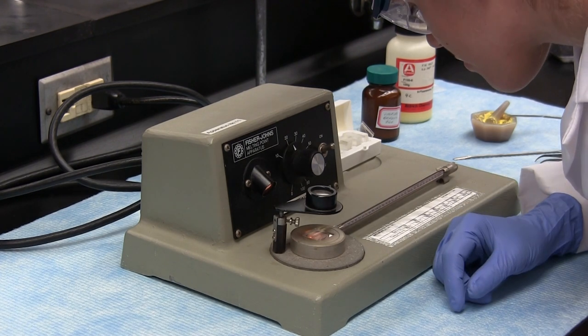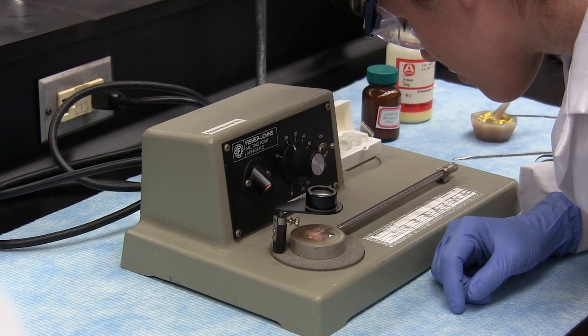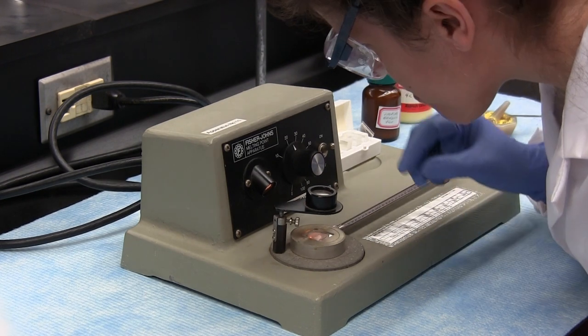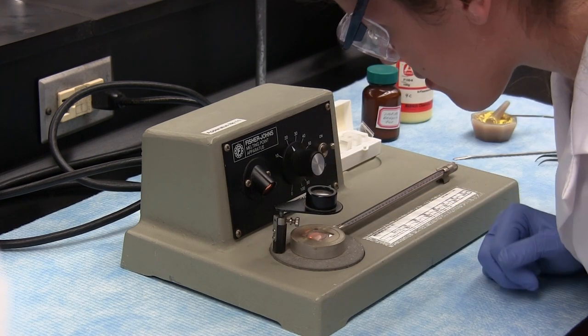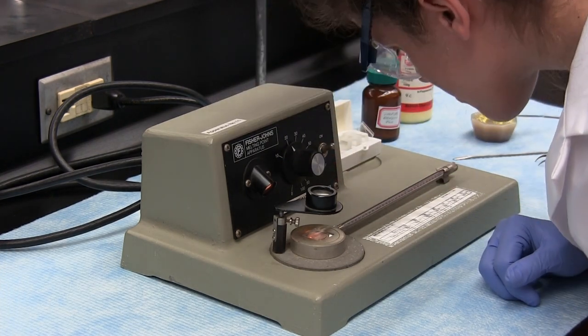It's very important here to maintain a slow rate of heating as we approach and go through our melting point. Doing this allows enough time for the temperatures of the stage, the thermometer, and the sample to be in thermal equilibrium. If the temperature is climbing too rapidly, you'll not get an accurate melting point. In such a case, can you think whether this would produce a high or a low melting point value?